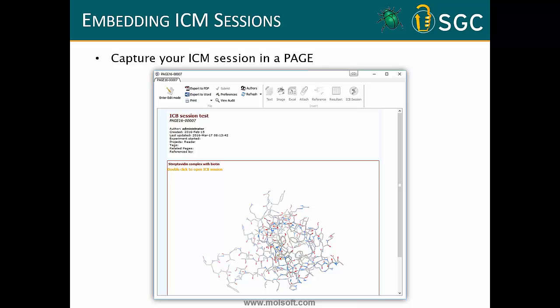And the second reason is that we didn't want to constrain users' experiences to within Excel when there was a better environment elsewhere. So if you're going to do Excel-like stuff, you might as well do it in Excel. And then when you're happy with it, throw it into Scarab. And if you want to make changes, you double-click on it, it opens in Excel. It's an environment you're used to, and you know it's going to work. So those are the two reasons why we haven't implemented that way. Okay, great.